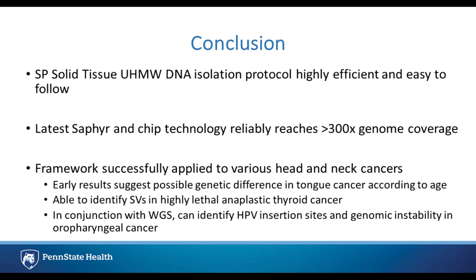How much does it cost to analyze a genome with optical mapping, roughly? In my experience, it's about $400 or so per genome for optical mapping. My experience with sequencing has been that it's closer to $1,500 or so per sample, and so the price point is definitely in Bionano's favor for that.